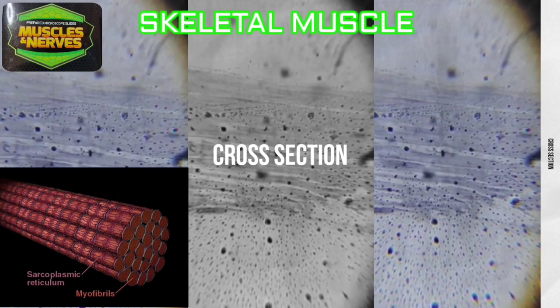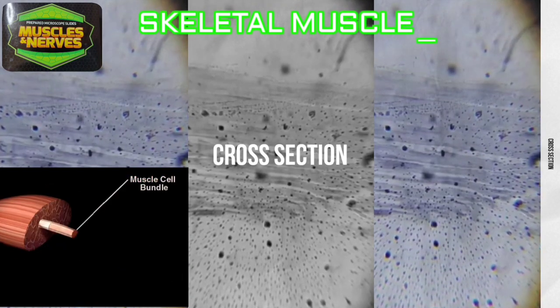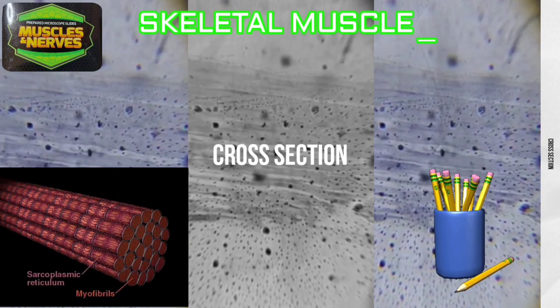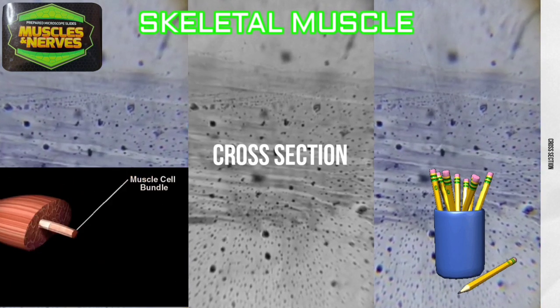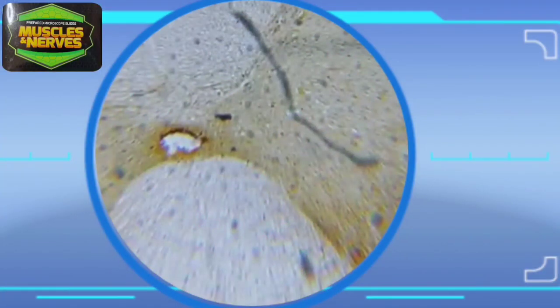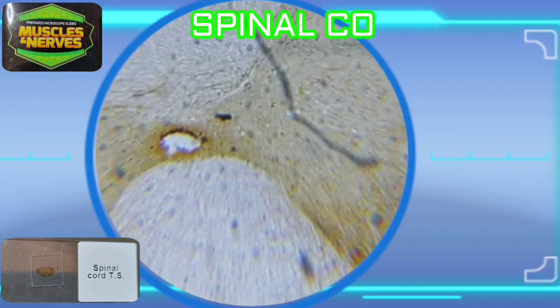The cross section shows the individual fibers looking like small circles massed together, sort of like looking at the eraser end of a bundle of pencils. We are looking at the spinal cord, the cross section.